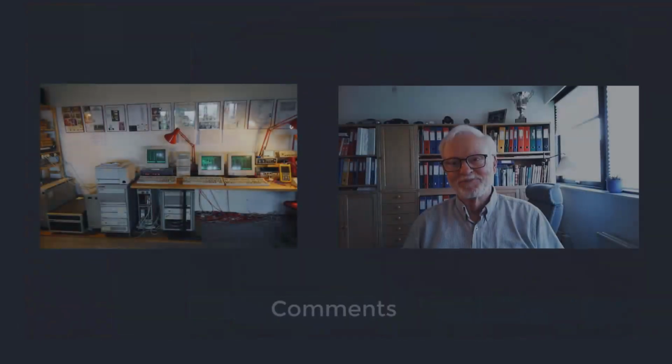Hi. A friend of mine remarked after watching the videos about the HP1000 and the Labka system that I was so impressed about the HP1000 system and the development of Labka.